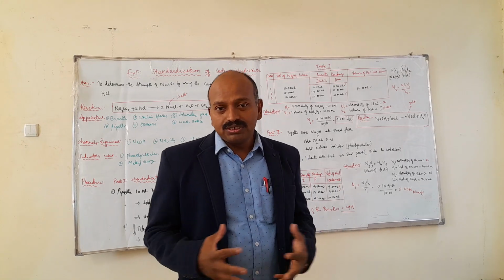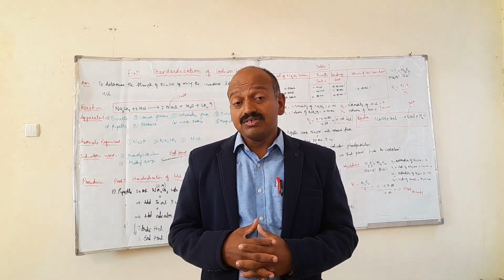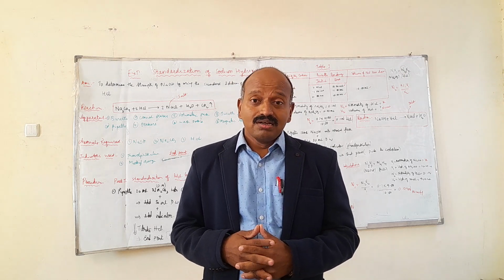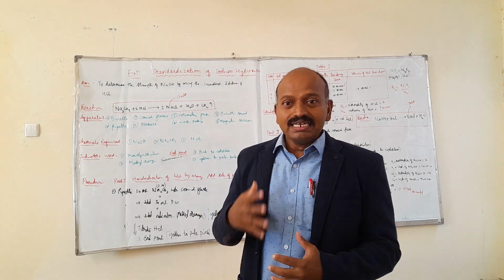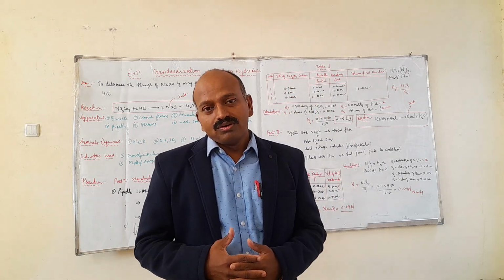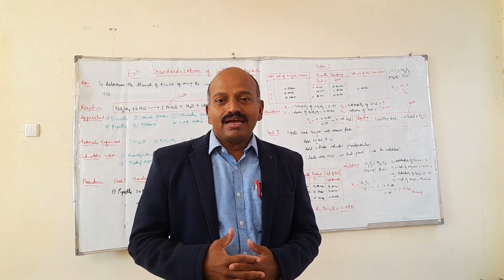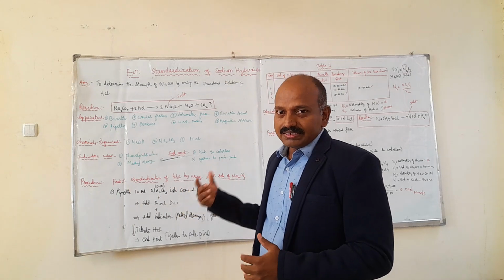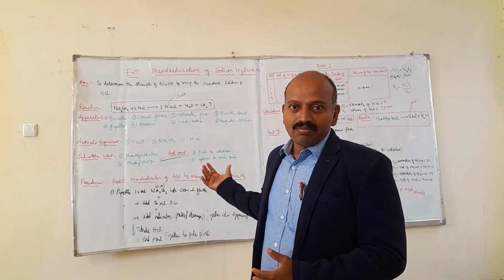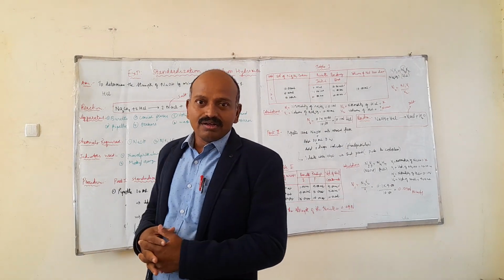So this is the procedure to perform part 1 and part 2. Very simple reaction and very interesting also. You should understand how part 1 and part 2 have been done. So this is about the theoretical part of the experiment. Now we are going to perform the experiment visually, physically and practically. Let's perform the experiment and come back for the second video, to see how we can incorporate these values. Okay, thank you. You can note down the procedure.